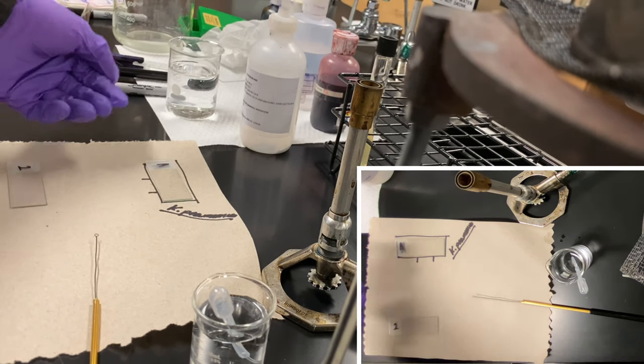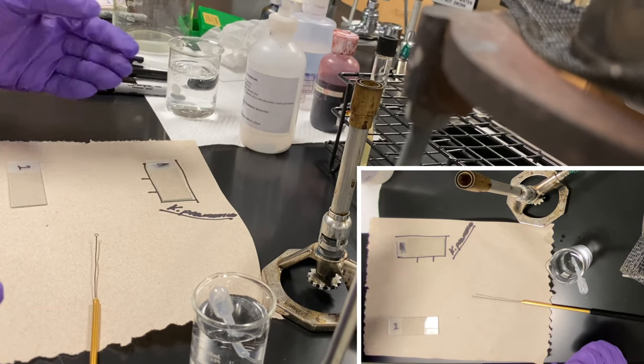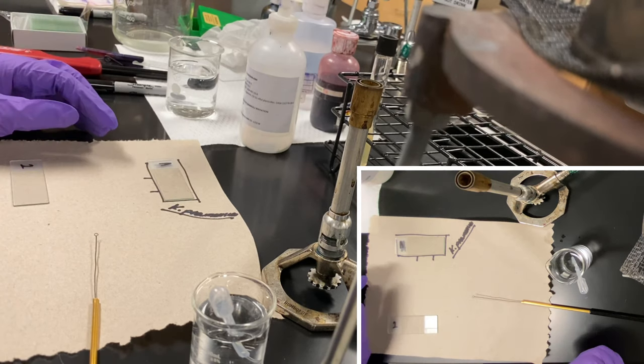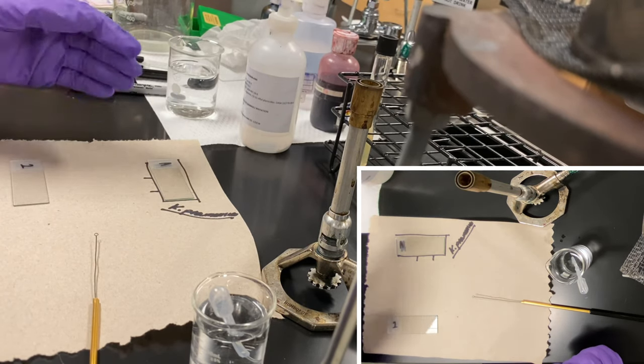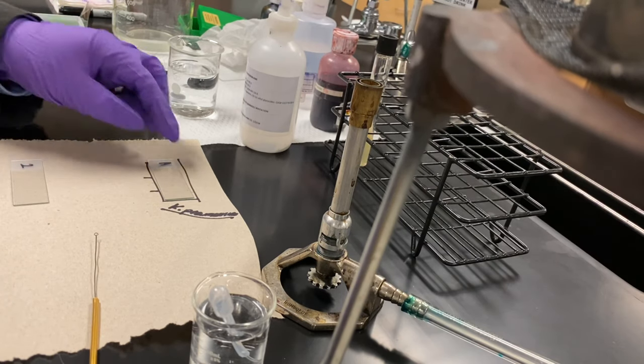Technically there's two ways to go about this. We can let this air dry, which is one method, but what we can do is actually heat dry it using a bench heater. We let it sit there for about a minute to allow it to air dry and then fix it to the actual slide.